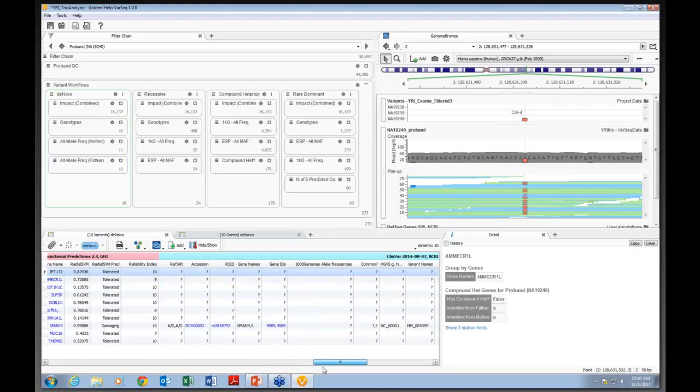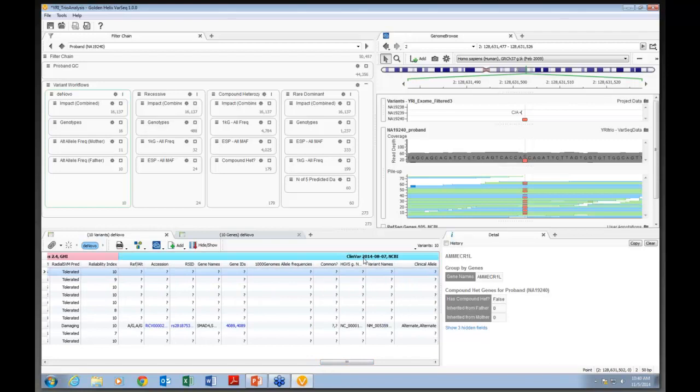And ultimately, out here toward the end, we see this ClinVar annotation. ClinVar, of course, is a database that catalogs all of the known variants that are associated with diseases. It's in the public domain, of course. And ClinVar is one of our primary sources that we're providing for identifying, again, known mutations and mutations of clinical significance. In this case, as I look at this list, clearly there's just one of them that is previously cataloged in ClinVar.